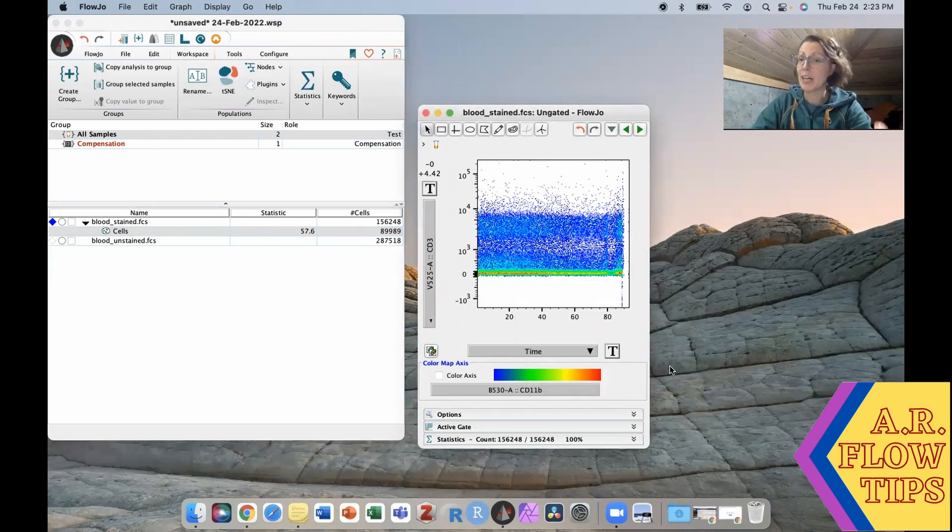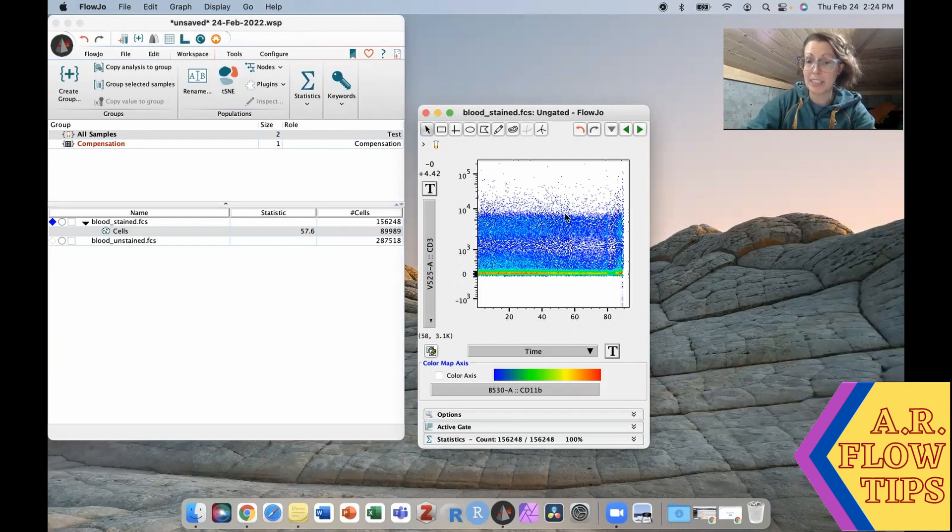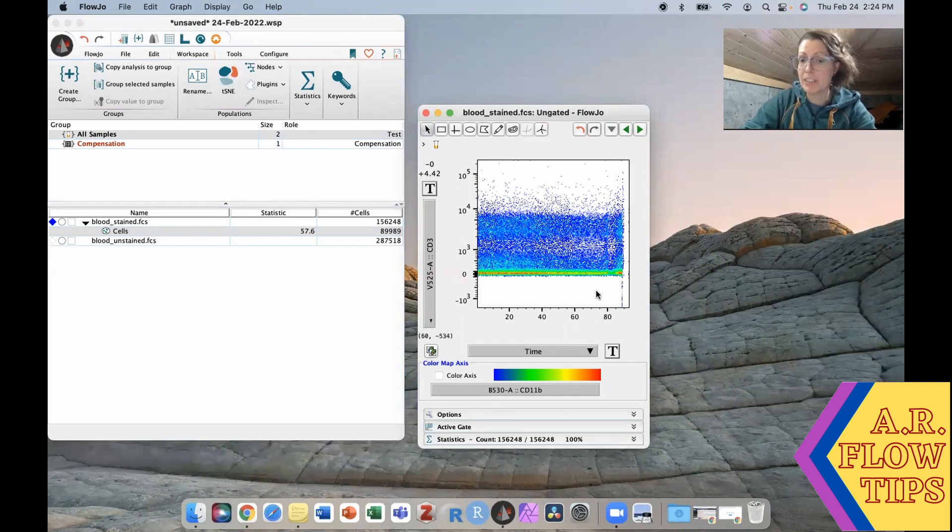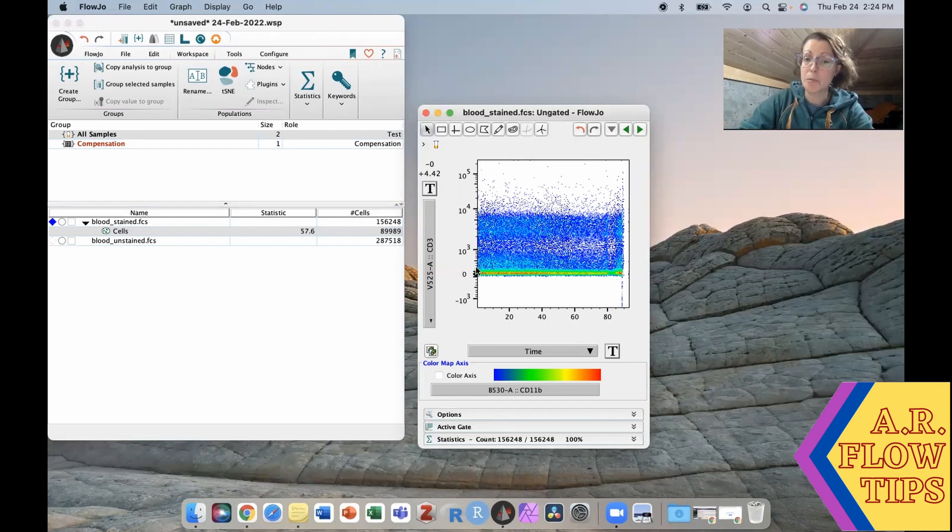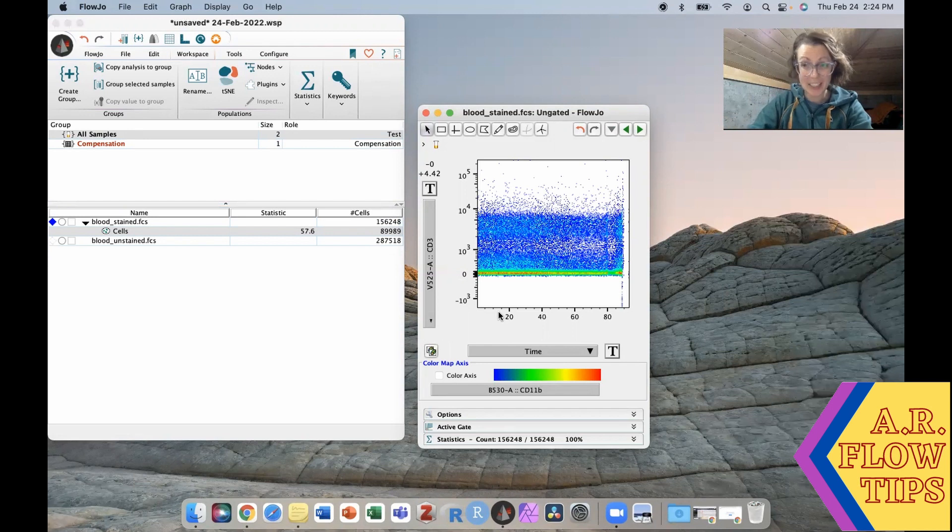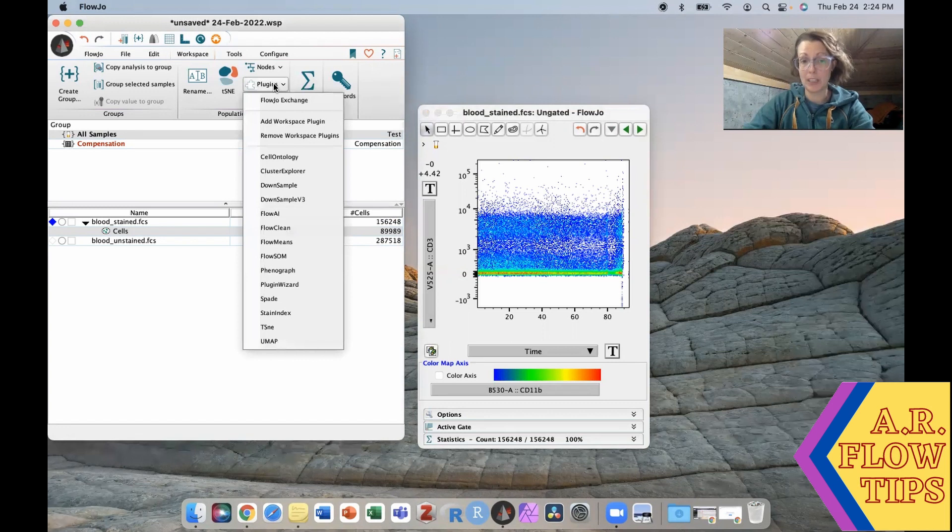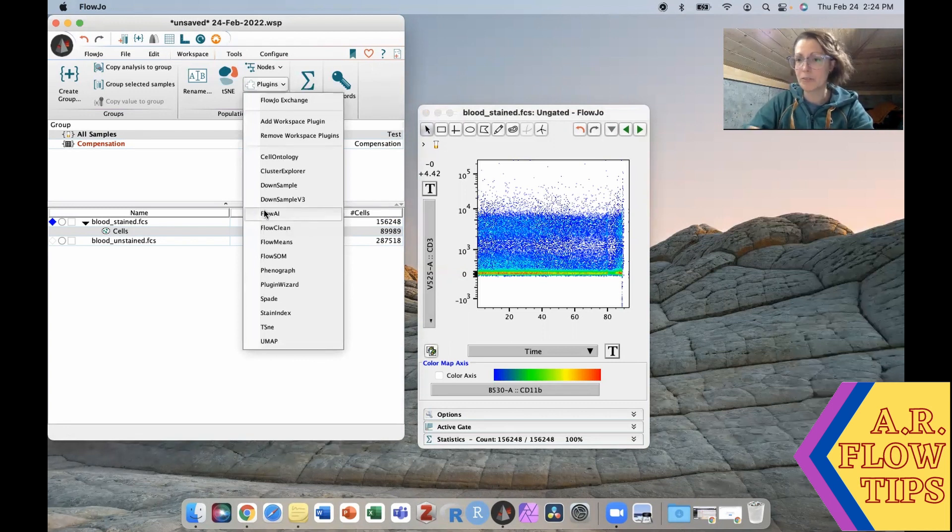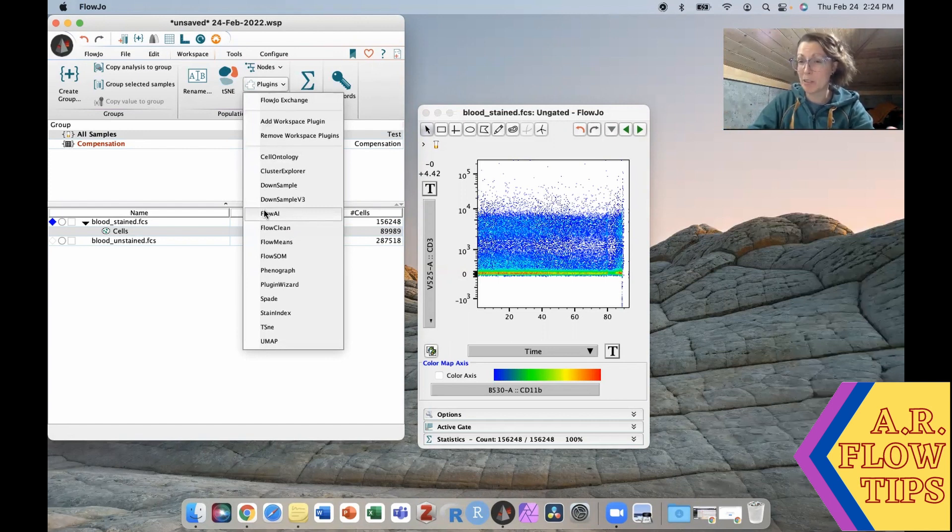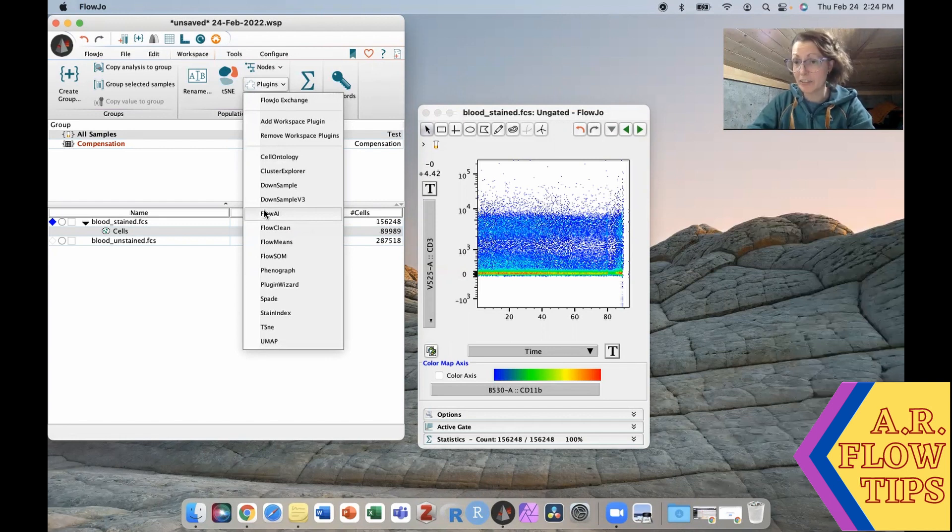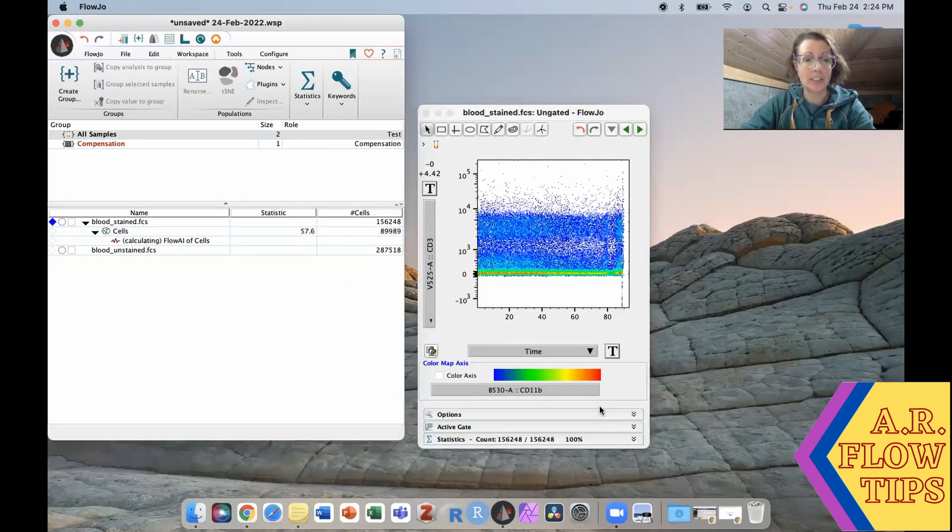However there are now tools at your disposal that are more fine-tuned because in this area where our fluidics is maybe not as good there may still be some good events, and in this area where our fluidics look good there may actually be some bad events. So to look at this we're actually going to use a plugin. There are a few different ones, I generally use Flow AI, there's Flow Clean. I would recommend going back and reading the original research papers to figure out which one is going to work best for you or test out a few and figure it out that way. So if we open up Flow AI we're going to go ahead and run that on our population.